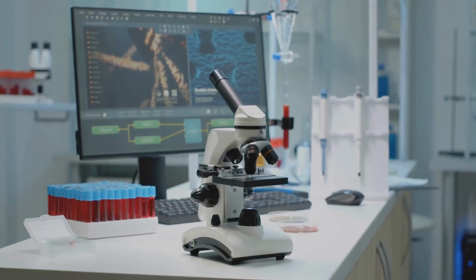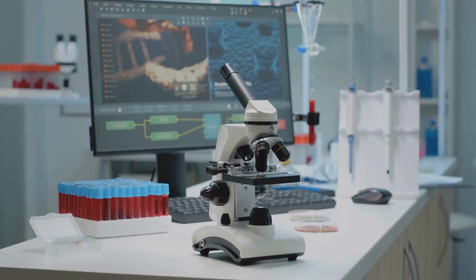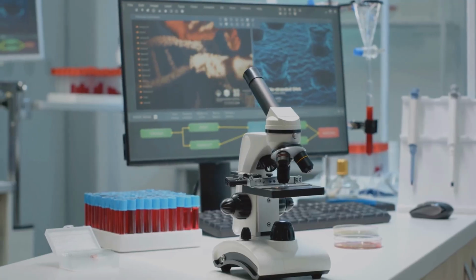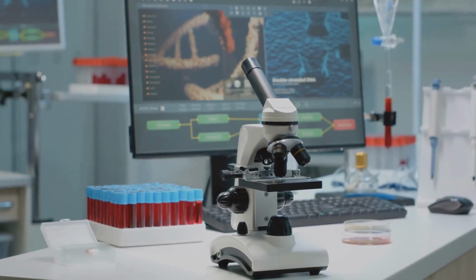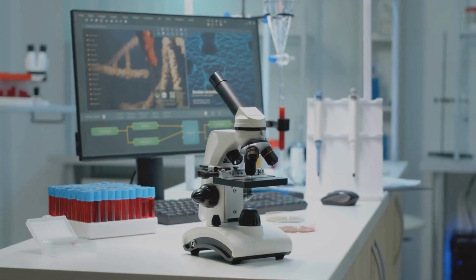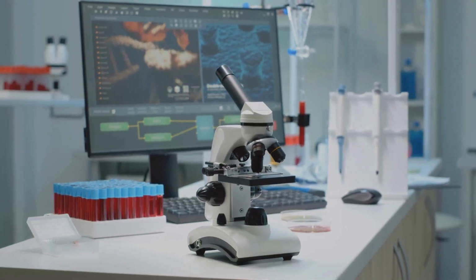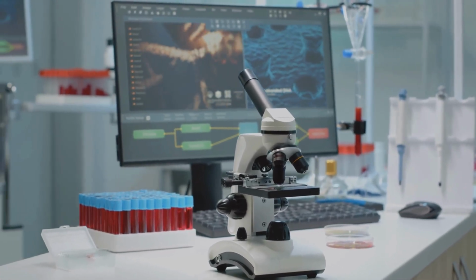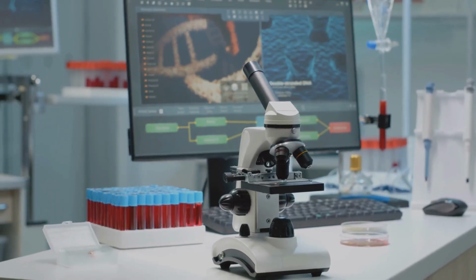The digital revolution has also completely transformed microscopy. Gone are the days of squinting through an eyepiece and sketching what you see. Today, high-resolution digital cameras are standard on almost all research-grade microscopes. This allows for easy image capture, storage, and analysis.